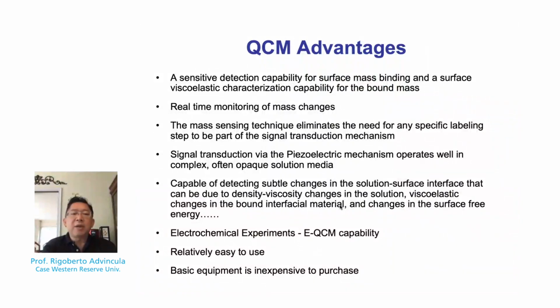And as I said, the Sauerbrey equation is quite simple and direct and applies mostly to vacuum, but of course can be extended when monitoring the frequency shift under air, or corrected in the presence of solution or changes in the density and viscosity of the media so that it can be represented better. So-called corrections to the Sauerbrey equation include the Kanazawa equation and factors that account for the viscoelastic nature of the media itself.